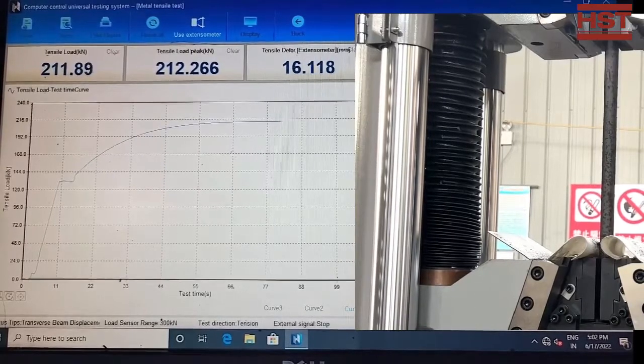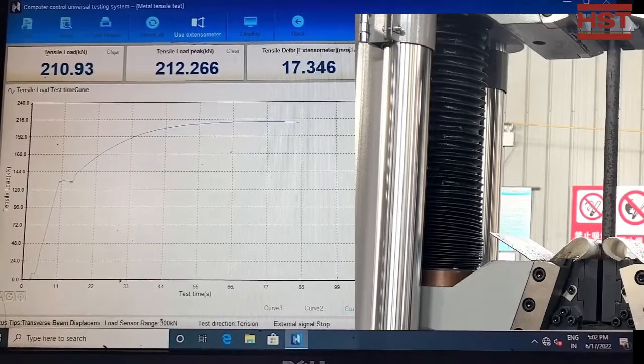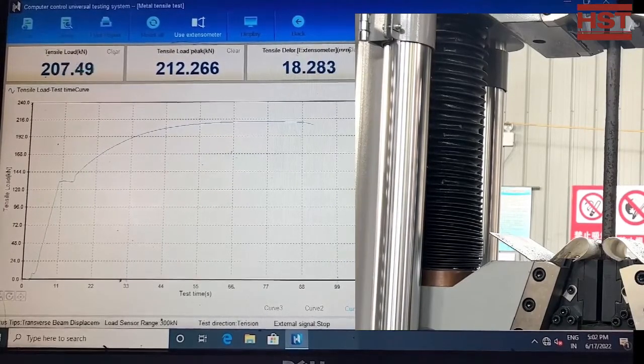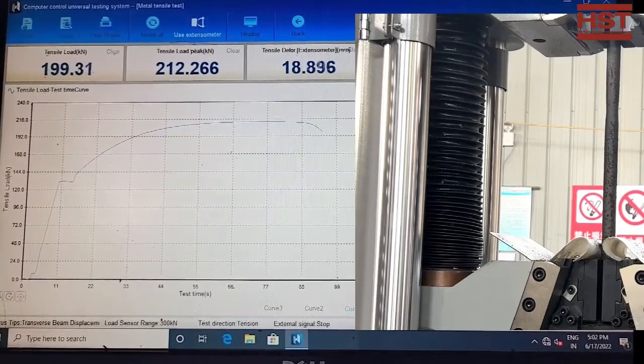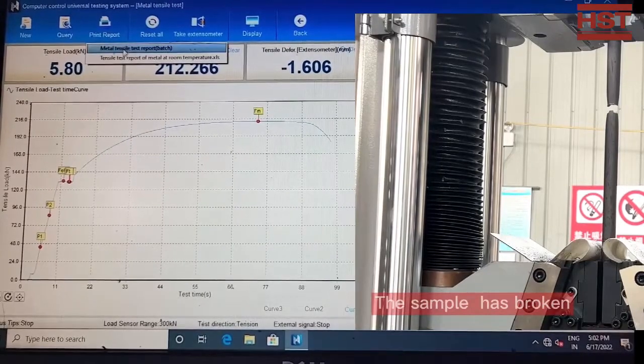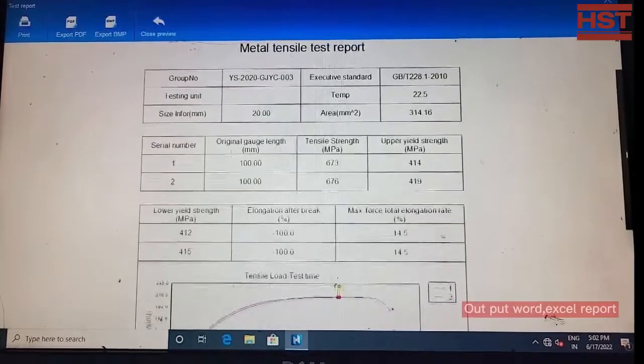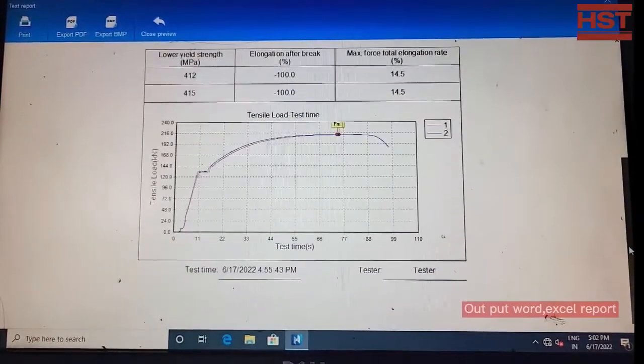The sample is getting skinnier — we are waiting for the break. The sample has broken, and the software will automatically save the testing result. You can output the testing report in Word, Excel, or other formats.